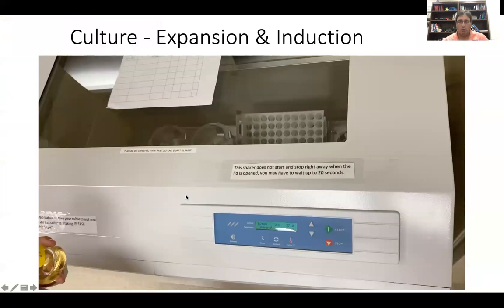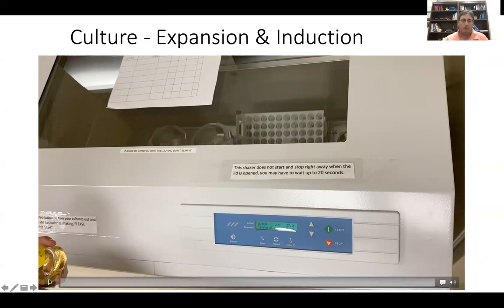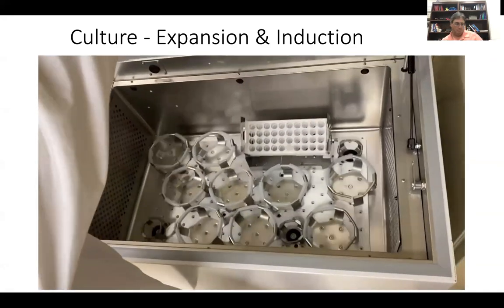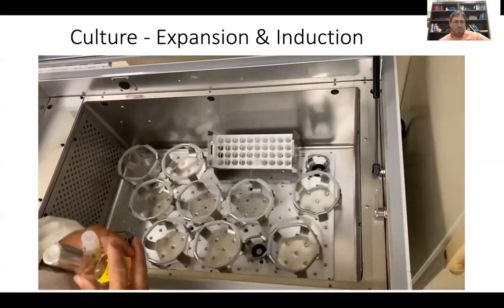All right, so what we do next is take those starter cultures and put them in a shaker. Here's some specific information and safety about using the shaker incubators. This is a shaking incubator. We typically keep this at 37 degrees.